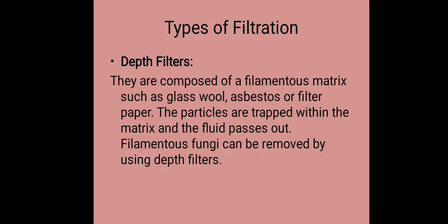Now, the first type of filtration is called depth filters. These depth filters are composed of a filamentous matrix such as glass wool, asbestos, or filter paper. The particles are trapped within the matrix and the fluid passes out. Filamentous fungi are usually removed by this method.